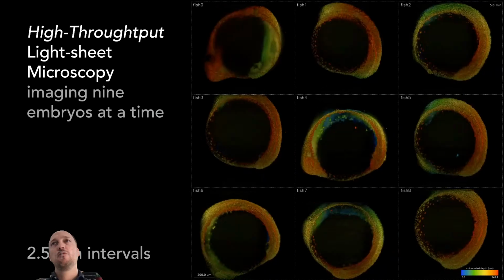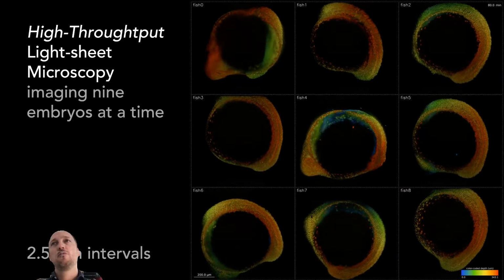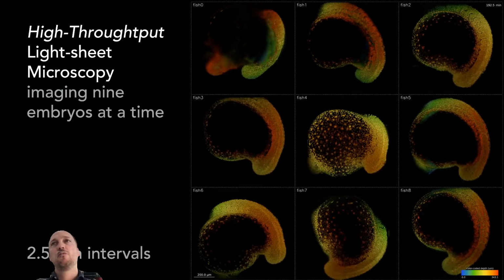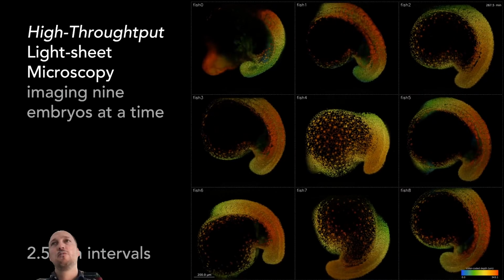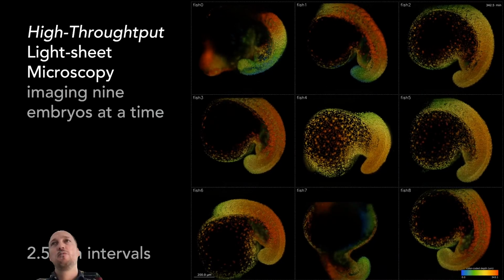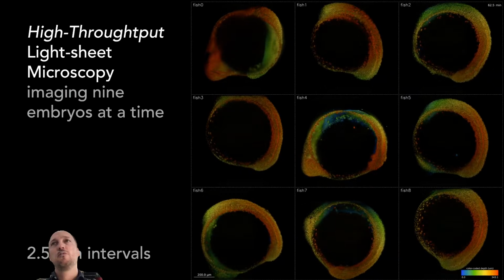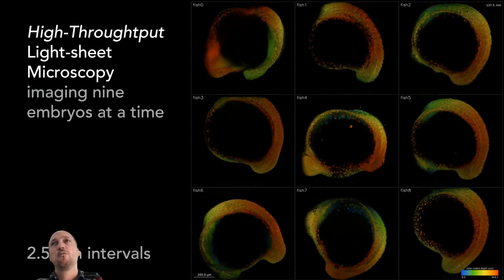Of course, not all embryos are perfectly oriented. Maybe some might eventually die. It's not the case here, but you could imagine that you want to study something, and you need to have enough replicates. You might want to only keep some of these videos, but at least it makes it easier to do this kind of high throughput experiments. You could imagine putting different drugs for different embryos. You could imagine having even more embryos than that. So you can start to imagine all the things you could do in terms of high throughput microscopy in biology here with embryos, something that's been a bit harder to do with light sheet microscopy because of the way things are set up in a standard light sheet microscope.